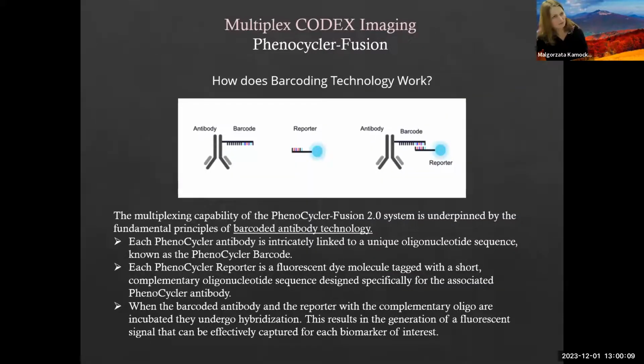And the last technique, which I would like just to mention, because I am not an expert in this technique, there's Connor in our facility who does multiplex Codex imaging. He has helped many investigators with this technique. And the beauty of this is that you can label the same section with many fluorophores. Traditionally, conventional technique gives us limitation to about 4 fluorophores. I would say you can try more, but it becomes more challenging.